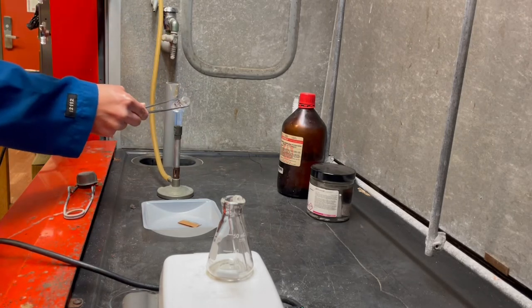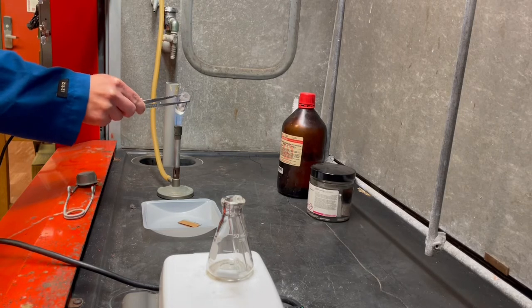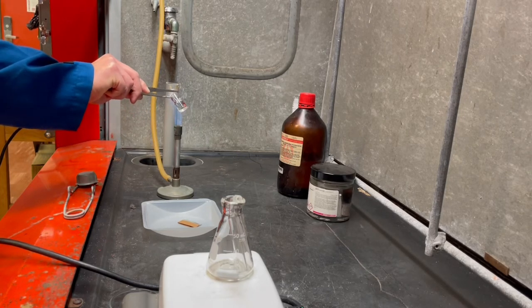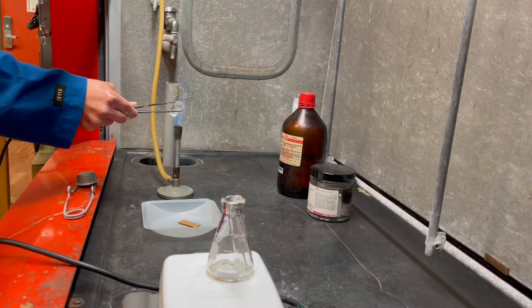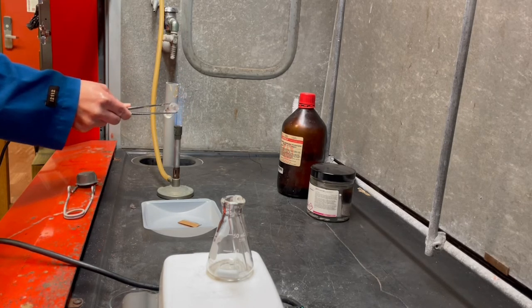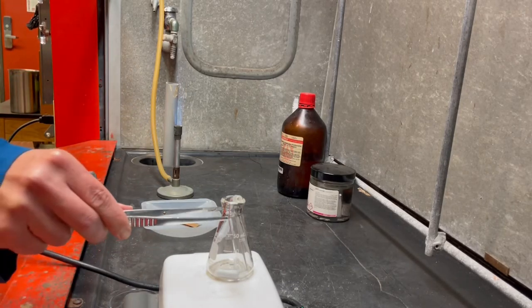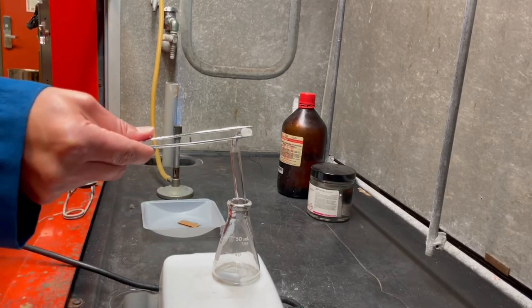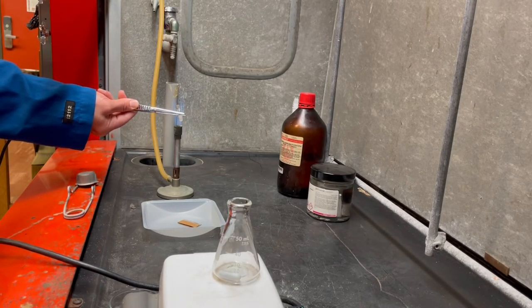There was a little sediment that formed on the lab coat, but the blue lab coat that I have is actually flame retardant, and I'm wearing this because I'm going to be working with elemental sodium, which is very pyrophoric. Elemental sodium can react with water violently and forms H2 gas, which, as we know, is also flammable, so I'm wearing this as a precaution.